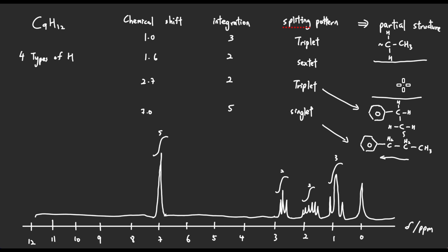So actually here, the structure we will get is this one. This is the middle carbon that is being pulled by the benzylic carbon and donated electrons by the methyl group. And that's why this carbon, sorry, just now I said it wrongly, this carbon actually refers to this carbon, and the R group over here and here matches up. And that's how proton NMR works and how we analyze this information to get the desired structure.